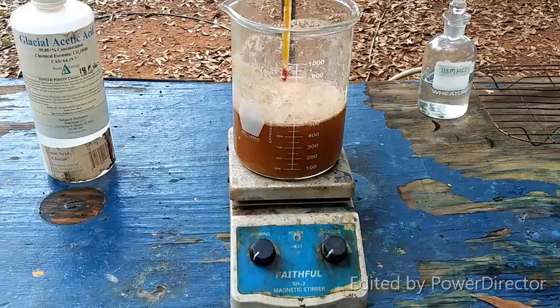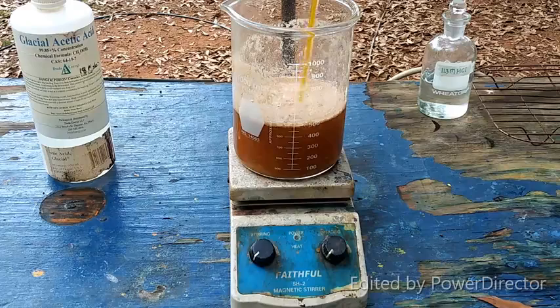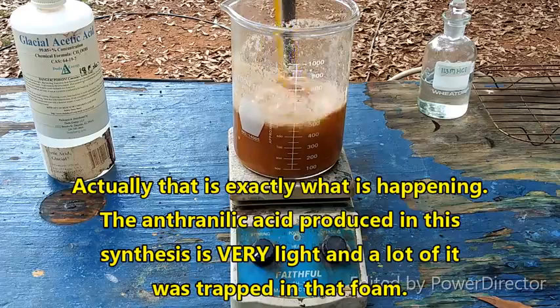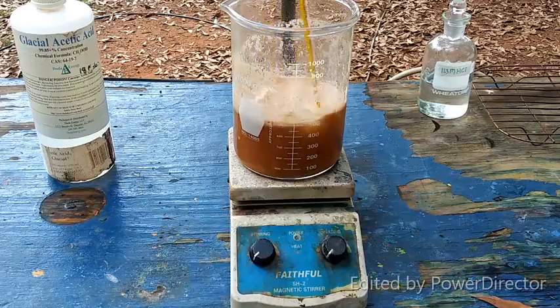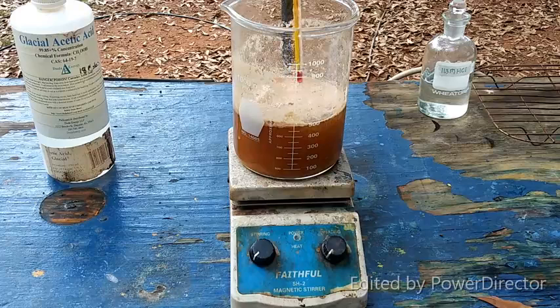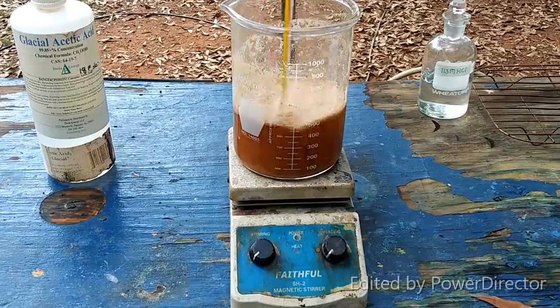Okay. Is the precipitate in the foam? What is happening here? You know, it's going to seem weird, but I think that might be what's happening.